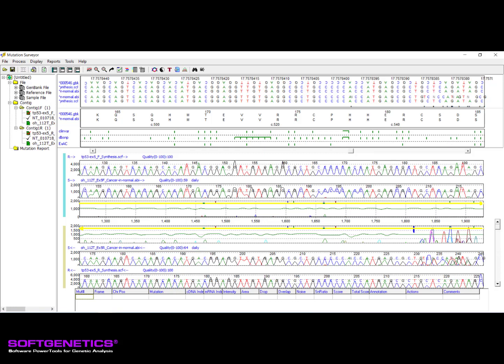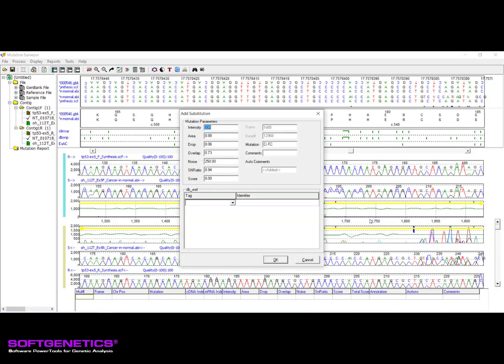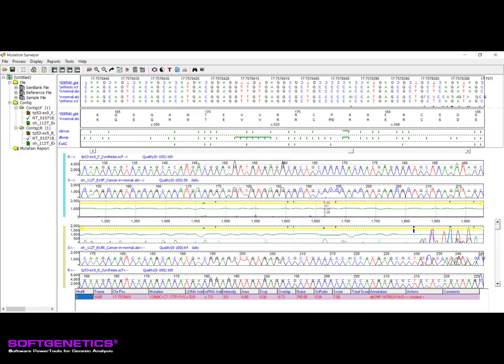Now let's take a look at how the GAD can be used to work with the mutation calls for a sample. New mutation calls can be manually added to your project using the mutation trace. To add a substitution event, such as a low frequency variant indicated by the 2D small peak bar, right-click the appropriate mutation peak at the location of the variant you would like to add and then select Add Substitution. Use the Add Substitution dialog to confirm the mutation call and add any custom annotation and/or comments, then click OK. The mutation call will then appear.